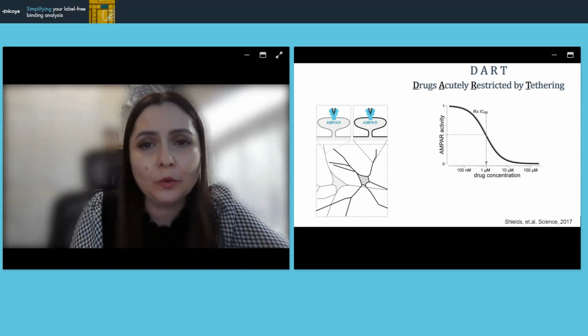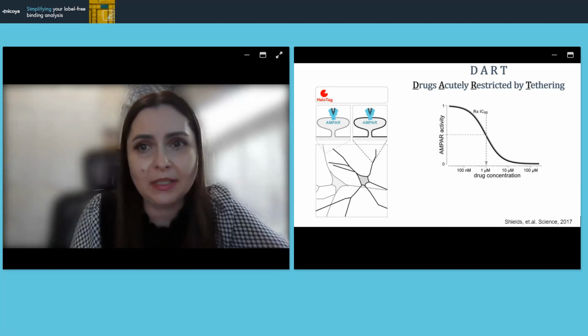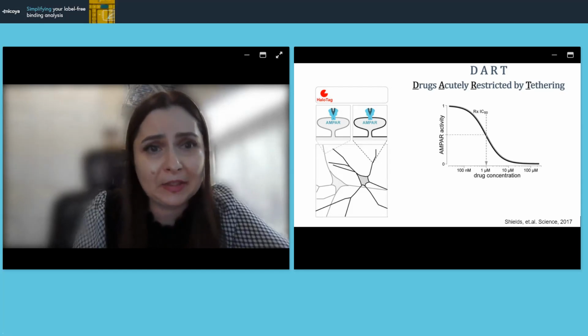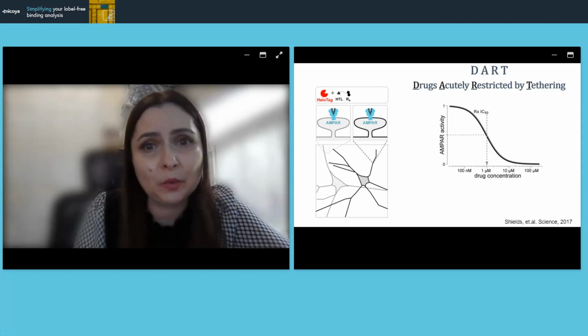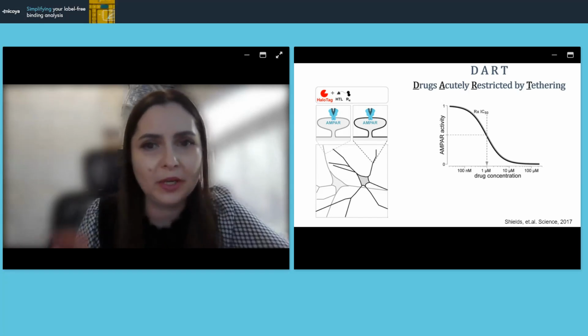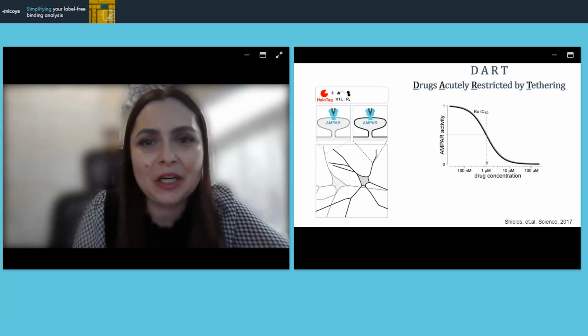And so what we design in our lab is this delivery of the drug by utilizing a covalent system containing HaloTag protein, or HTP, that covalently interacts with HaloTag ligand, which I'm going to call now analyte, or just a small molecule, because Nicoya has a different labeling system here.